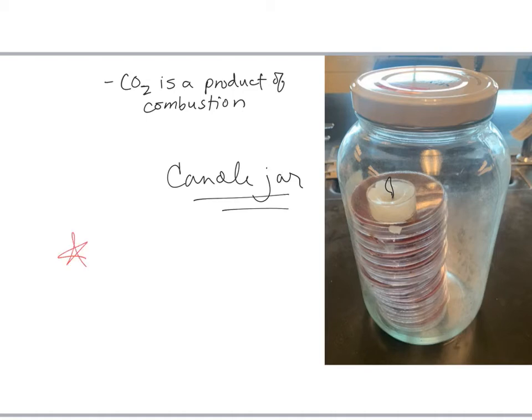Okay, big thing to note here is that staphs also grow fine in a candle jar. Okay, and that's highlighted in your lab book as well.